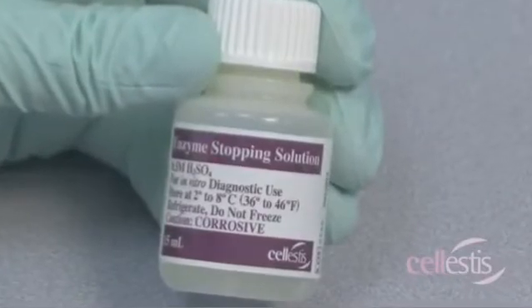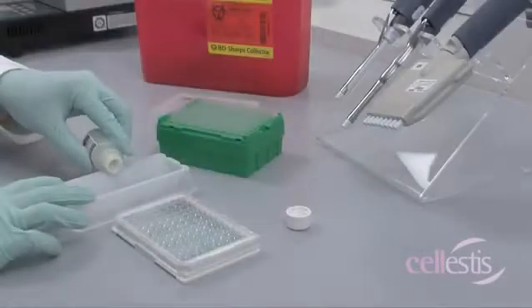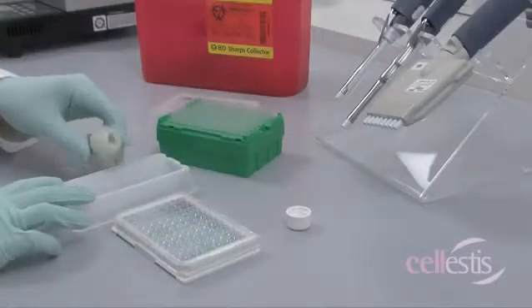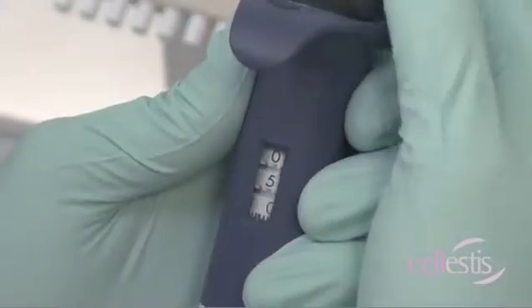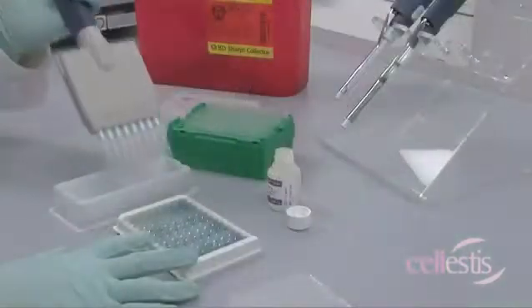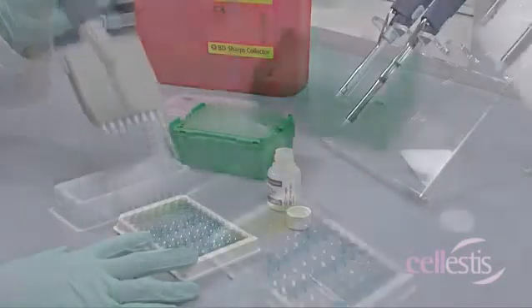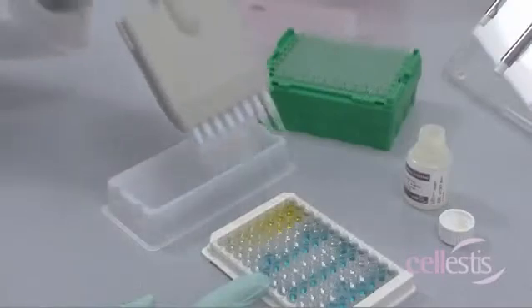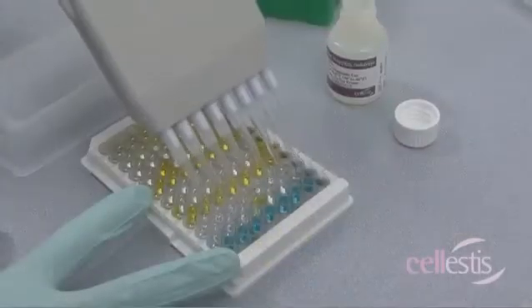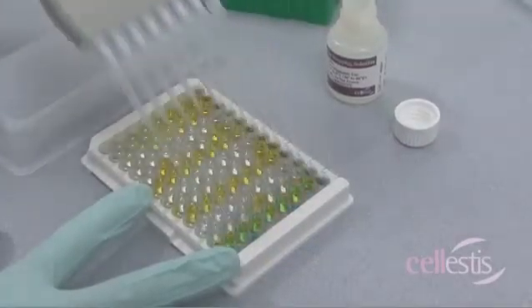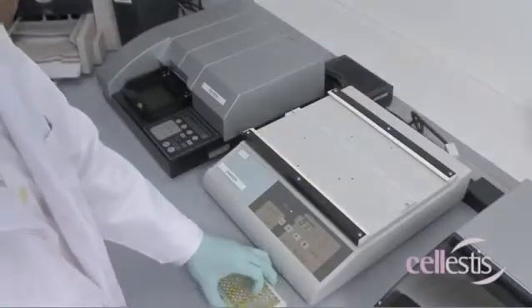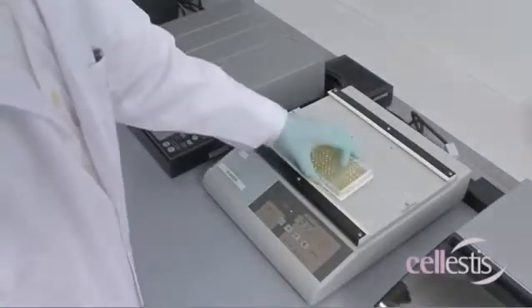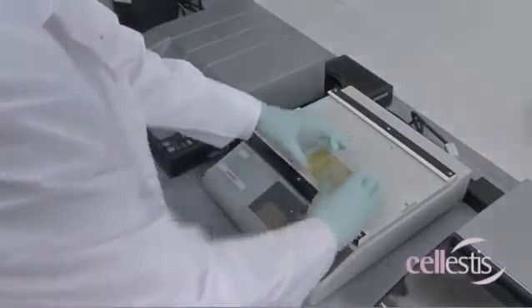After the 30-minute substrate incubation, add 50 microliters of enzyme-stopping solution to each well. Using the microplate shaker, mix the plate before reading.